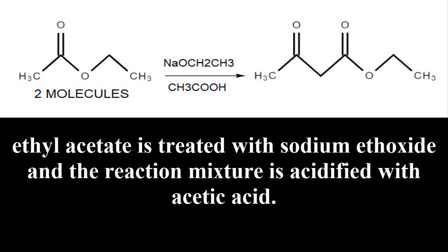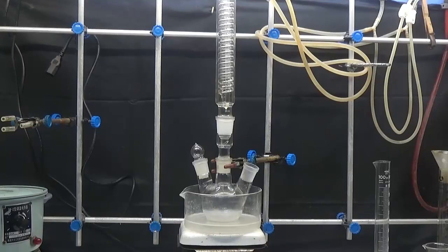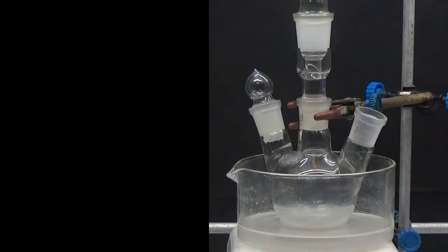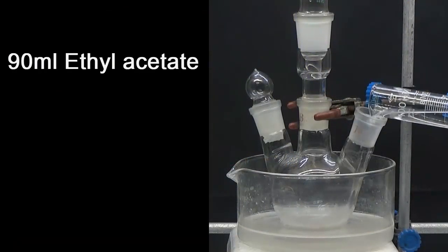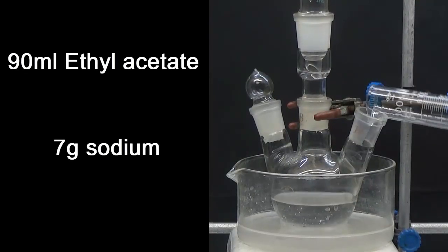To obtain ethyl acetoacetate, ethyl acetate is treated with sodium ethoxide and the reaction mixture is acidified with acetic acid. First, weigh 7 grams of sodium cut into small pieces in a vial with hexane. In a 250 ml three-necked flask in a water bath with a reflux condenser, put 90 ml of ethyl acetate and 7 grams of sodium in small portions with stirring.